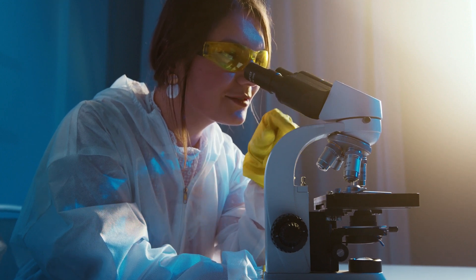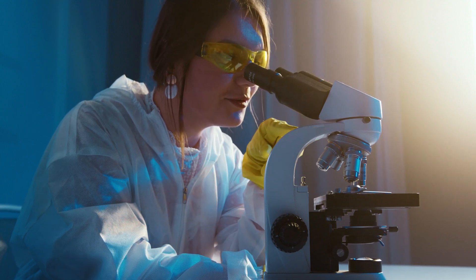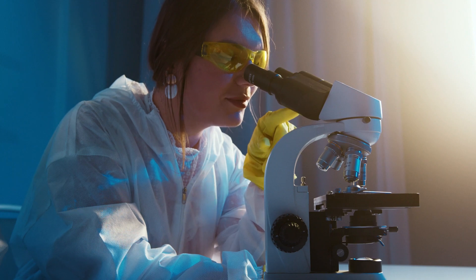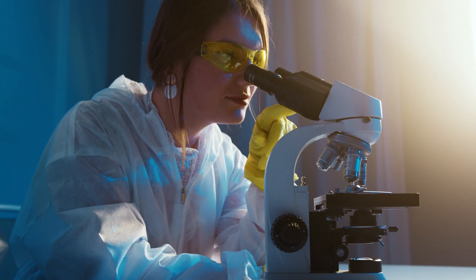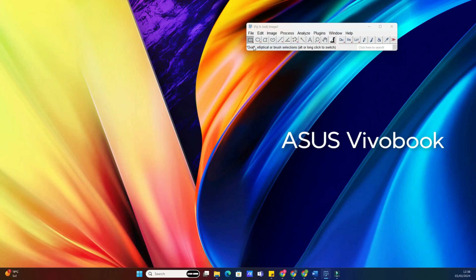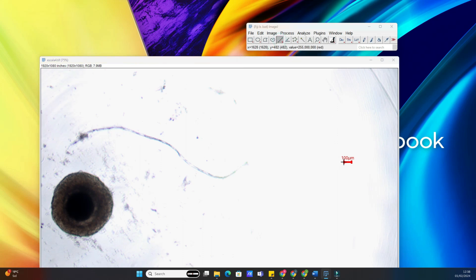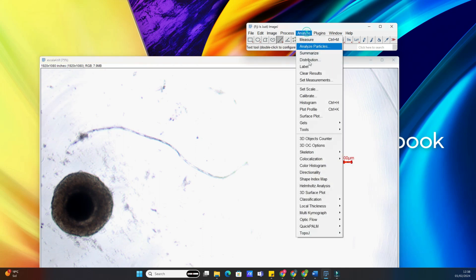Before we dive into the nitty-gritty, let's understand what batch analysis is. Essentially, it allows us to apply the same analysis to multiple images simultaneously, saving us a ton of time. Whether it's measuring particle sizes, counting cells or anything else, ImageJ makes it easy to automate these tasks.